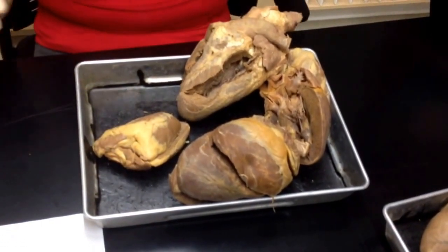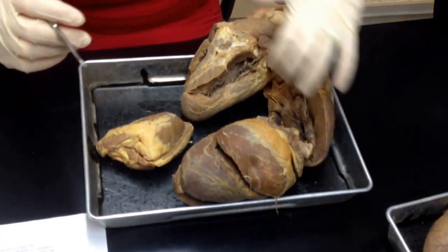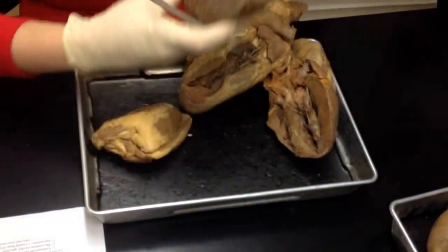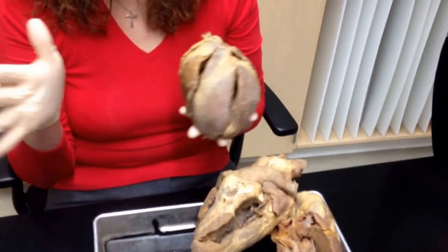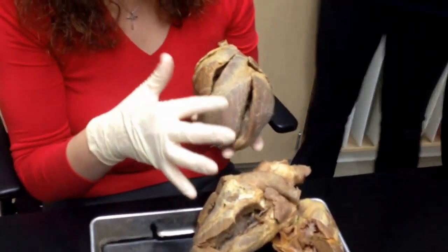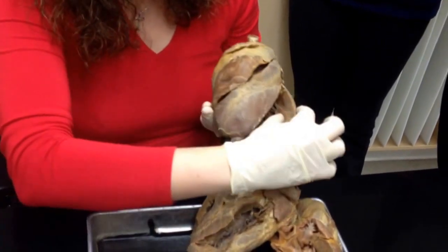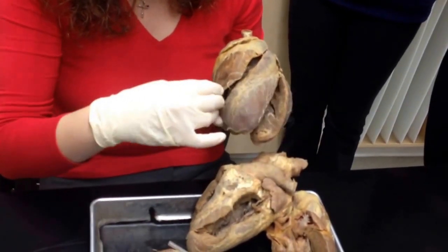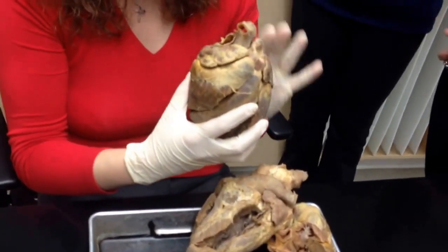Okay, so let me start off with external features. We are looking at the anterior longitudinal sulcus. You know that's anterior because you have to orient yourself as far as front and back on the heart, anterior and posterior. Here you have a thicker myocardium and a thinner myocardium, so you know that this is left, this is right, therefore this is anterior, this is posterior. That's a key thing before you do anything else.